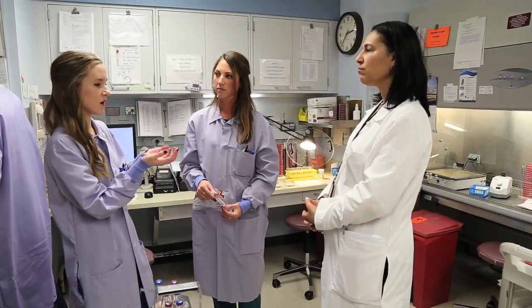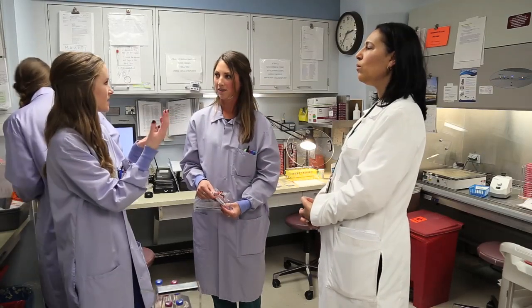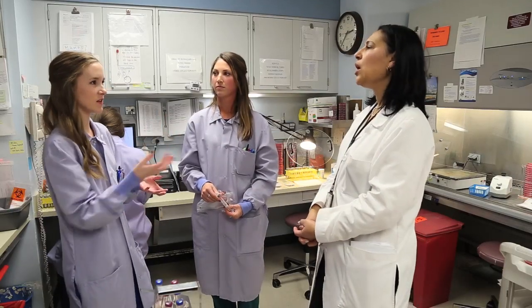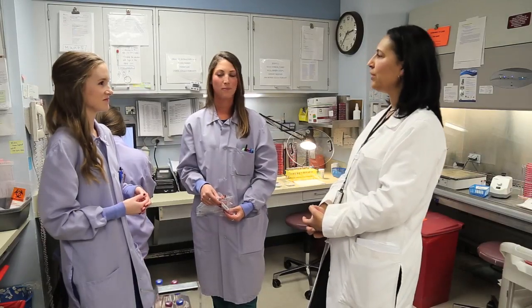And then sometimes it'll also go up into the, what's the top? I can't remember what it's called. The actual plastic syringe part? Yeah, it'll go up into the spiral part of the cap, and then we lose some of it too. Oh, okay, that's good to know. Okay, wonderful.